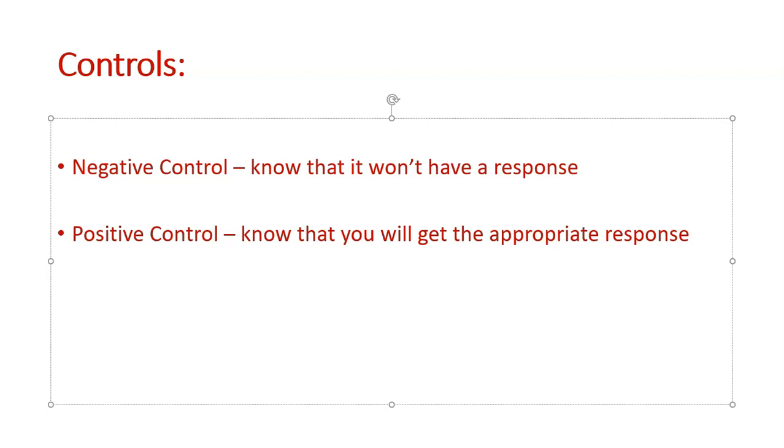One would be your negative control, something that you know for certain does not have glucose. Water is a really great example. Water is just water, so pretty straightforward there. Then you'd have a positive control, something that you would know would have glucose. So maybe you would want to do glucose itself. You could test straightforwardly: negative control, water, no glucose is present. Positive control, one where I know glucose will be present, and I'll test glucose.